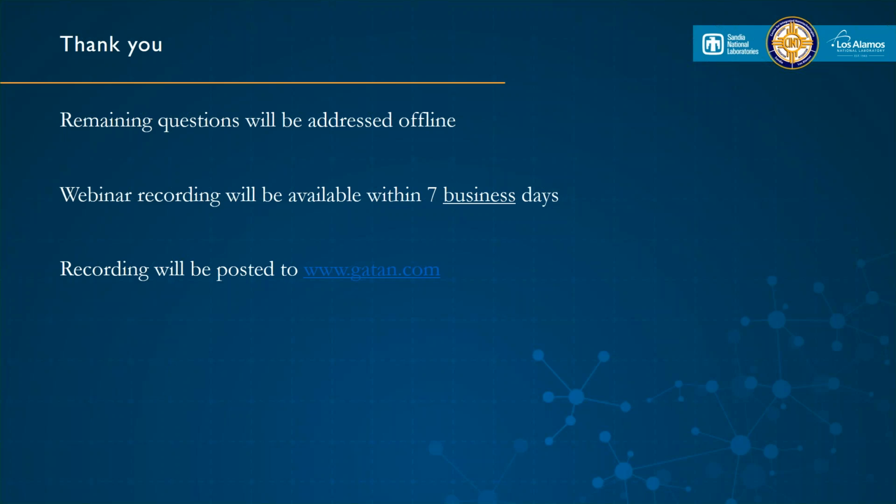Yes, most users that came in, we would have them bring their own external drive, and then they're able to take all the data home with them. And people that don't come on site, usually they ship a drive, and then we'll fill it up and ship it back. And we also have a processing computer here, so if they want to work on their data offline, they can do that. Okay. Yeah.